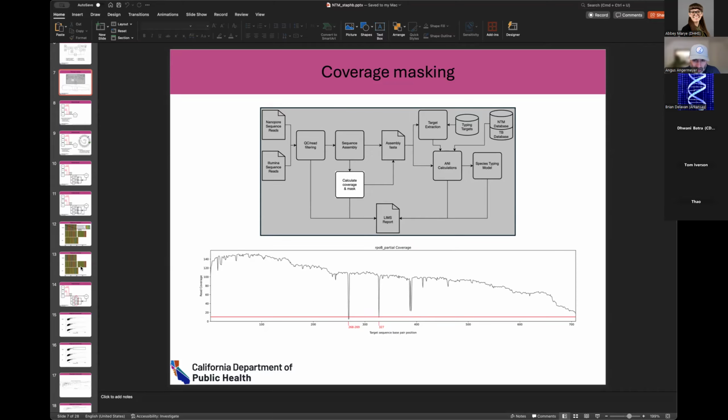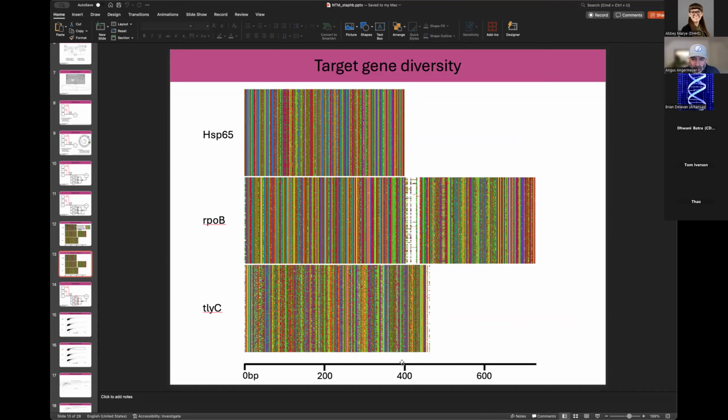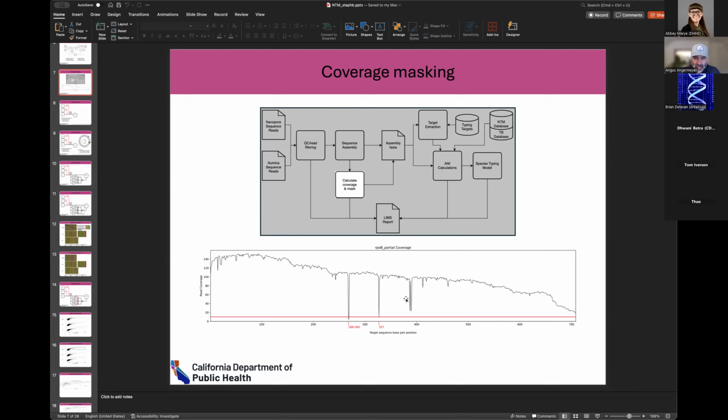And if I go to look, this is rpoB. Right around that 400 base pair position, there is this area where there are a few crazy insertions in a small number of species. So there's probably something going on around there, whether it's indel related, or there could be some sort of replicated insertion, an insertion element. Who knows? There could be biological explanations for things like that, but also things like this, where one base pair coverage across the same scale is just a little suspicious.